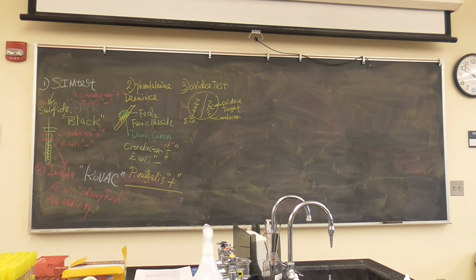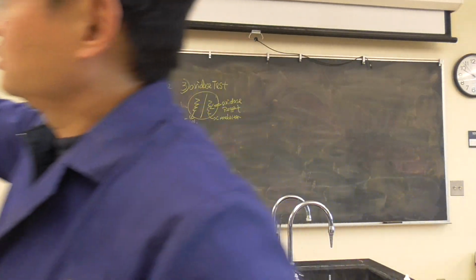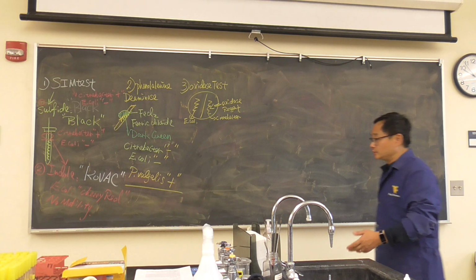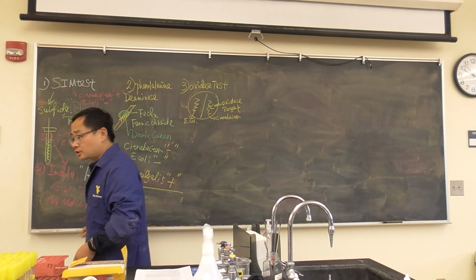You guys can see Citrobacter side start to show up. Can you see it? Yeah. So start to show it, but not very ideal. That's why I said that surrogate, compared to original Pseudomonas, they always have something which is debatable. What is a good surrogate? And then if you stay another 30 minutes, this started going to be showing you false positive because the oxygen is coming. Okay, so these things better we using the original culture, but we don't have it.